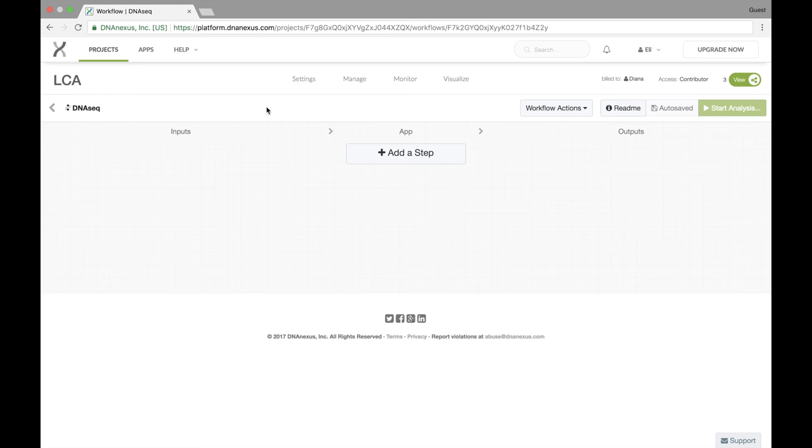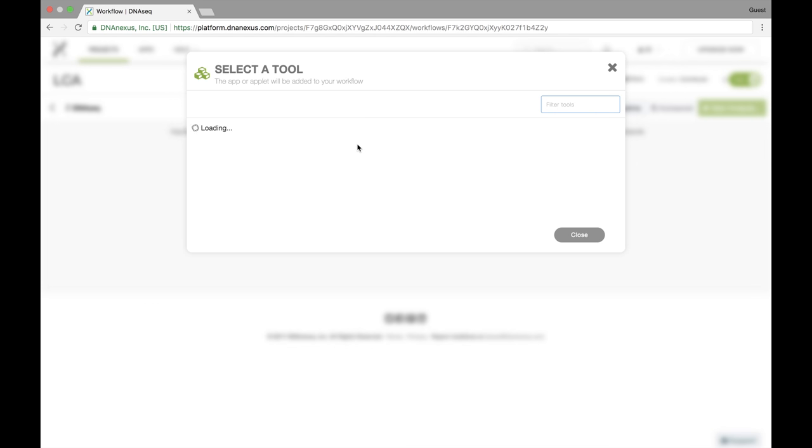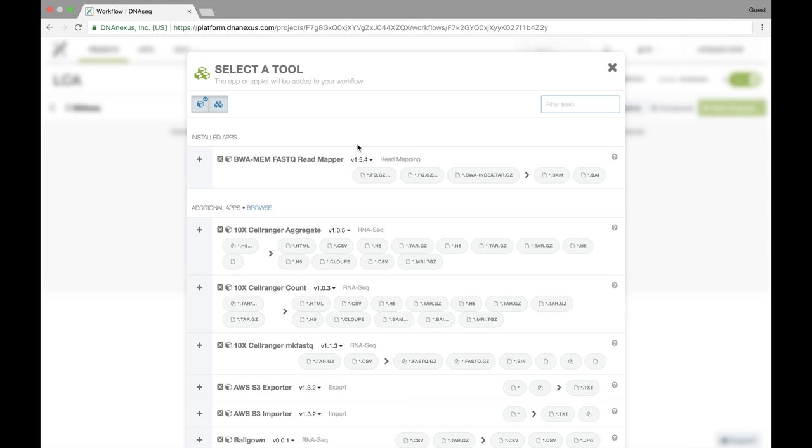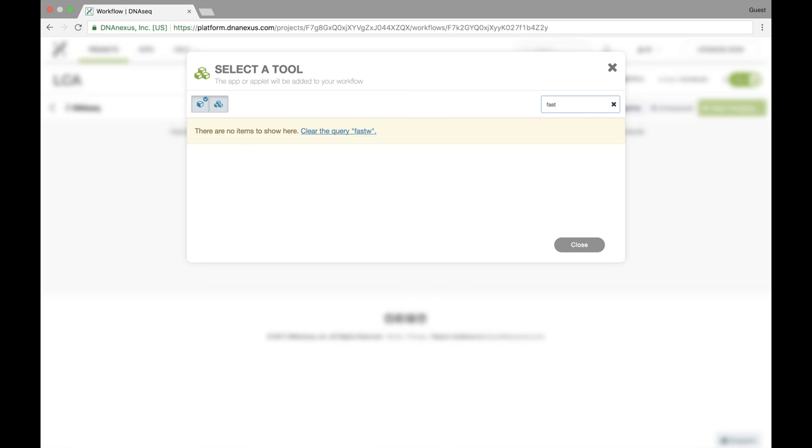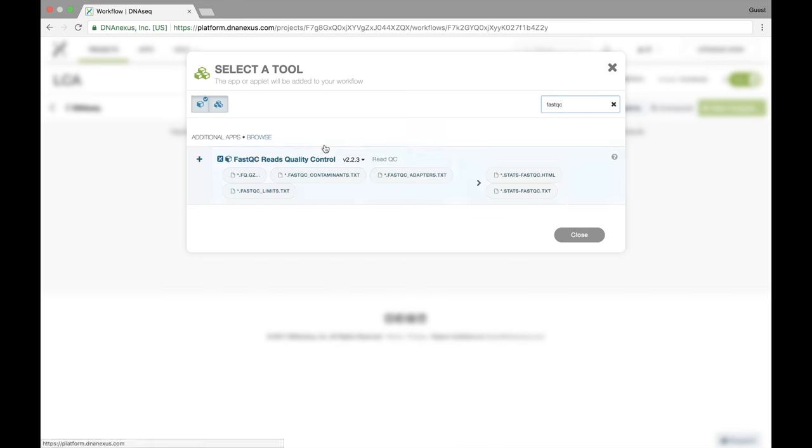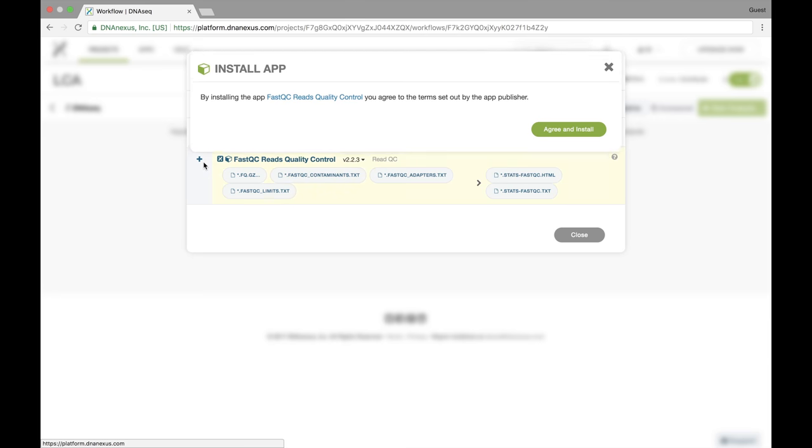So now that we've named our workflow template let's start adding steps. Steps are also known as stages on the DNA Nexus platform. When we add a step we'll be prompted to add a tool. In this case we said our workflow will start with some basic QC steps. We'll be performing our QC with FastQC. I search for it and I select it.